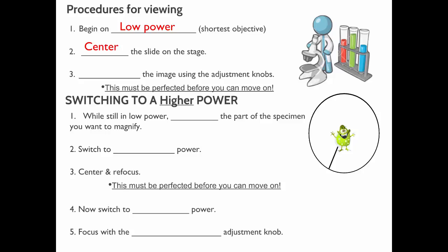So you look through there until your object comes into focus. And you twist it back and forth, and then you'll see something, and it'll be clear. So that's how you start. Now you have to be sure what you're looking at is centered, and it's very clear before you move on. So you always get it in focus under low power first.